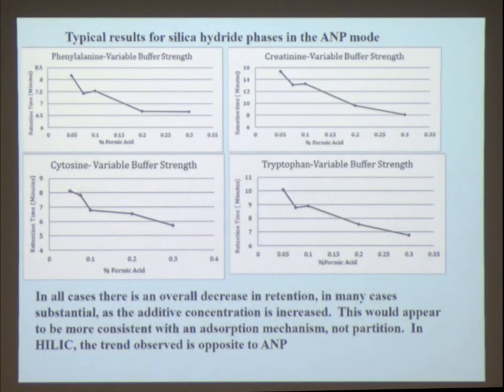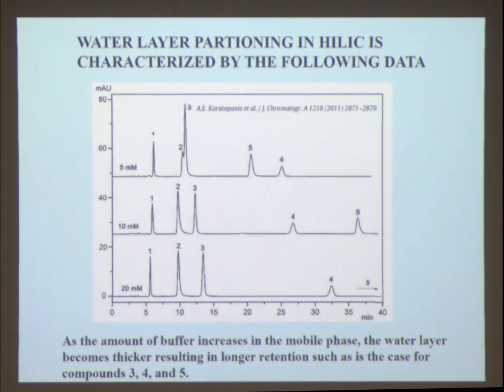This slide here just shows us that this water layer becomes thicker if we put a buffer in the mobile phase and increase its concentration. The components from the buffer also preferentially go into the adsorbed water layer, making it even more polar. And most compounds that are hydrophilic begin to retain longer. That's a very well accepted observation about what happens with the silica materials.